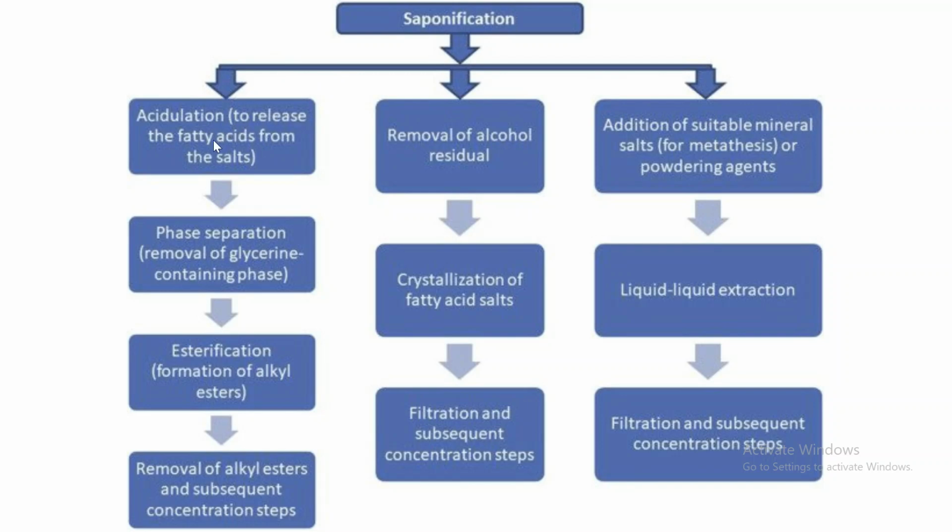This can in turn lead to phase separation, which is the process of removing the glycerine containing phase. And then it goes into esterification, which is the formation of an alkyl ester. And then it goes into the removal of alkyl esters and subsequent concentration steps.